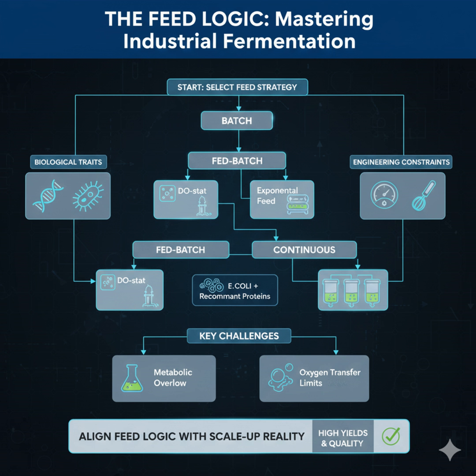And the resulting quality failure from that? You get wild batch-to-batch variability in the purity and concentration of your final target molecule. Maybe it's an organic acid profile. The simple fixed feed just fails because the input is too inconsistent. So the solution has to be feedback control. The quality-aware solution must be a fed batch with quality-aware control. After some minimal pre-treatment, you have to rely on a feedback loop like a robust DO-stat, or even substrate sensors if they're available, to automatically compensate for those variable inhibitors, ensuring the organism only ever sees the sugar at a rate it can safely handle.